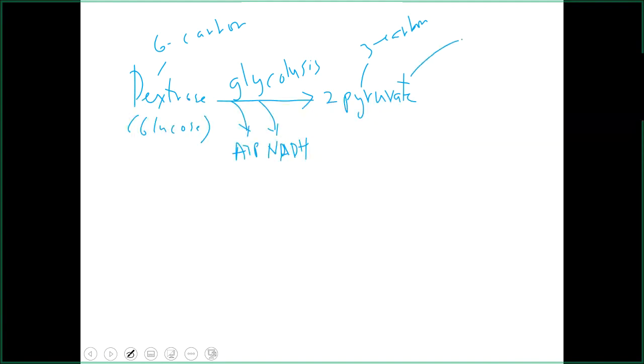So what mixed acid producers do is they run this through a series of reaction steps, and they make more ATP, and they make more NADH, and they make FADH and other stuff. We don't need to worry about that. But the end result then is the production of a mixture of acids. Now, what other organisms do that aren't, I apologize for that mess, it's awful. So that's one route, all right?